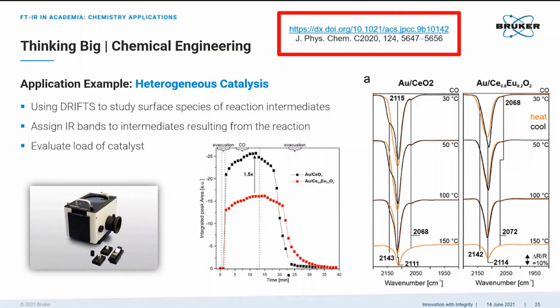The reason behind was less spectacular. The doped particles exhibit bigger average particle size, and catalysis activity reduces with the decreasing surface to volume ratio. Anyhow, FTIR helped to deliver this conclusive evidence.